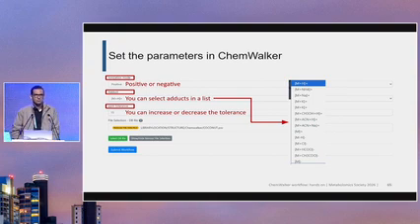This is related to finding drugs and stuff. Yeah, I'm sorry. So while I'm trying to fish for what drugs are present, or what food ingredients and compounds are present, how do I decide the peak threshold?